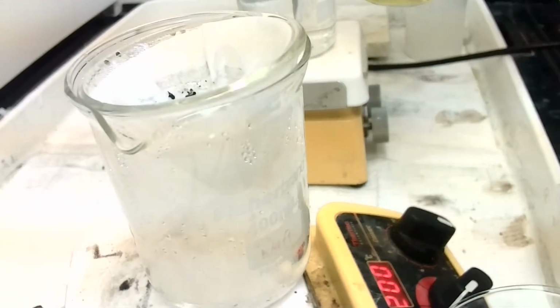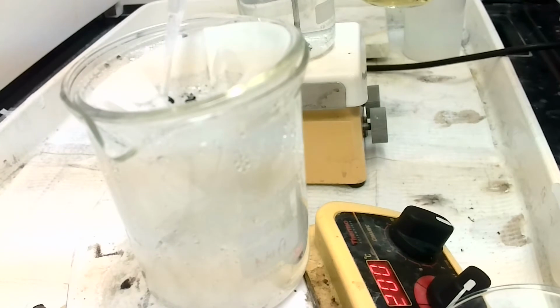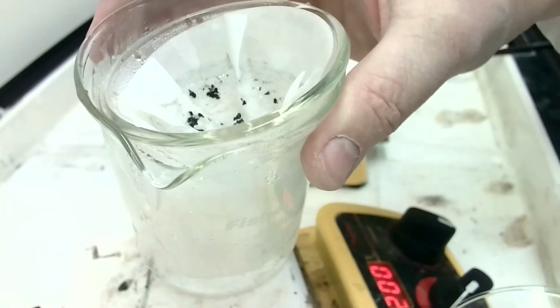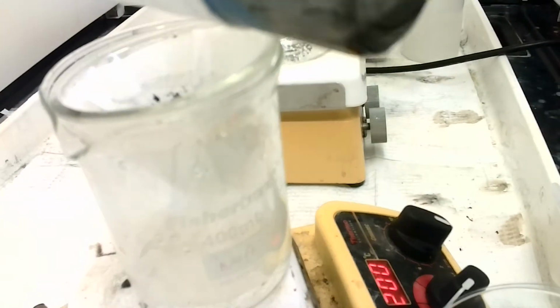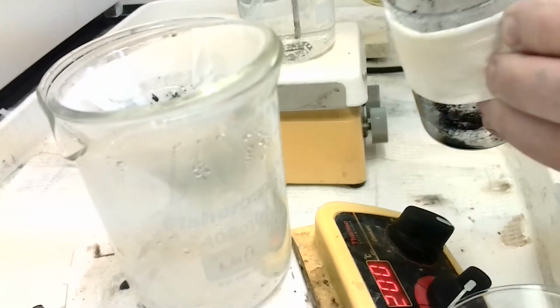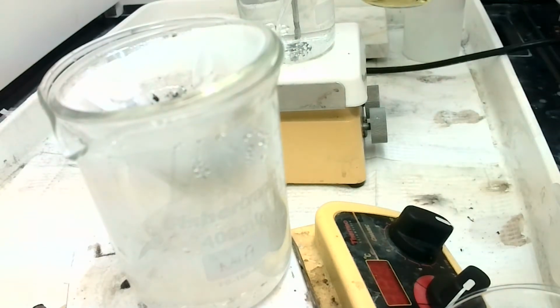A little bit. Yeah, if you catch the light just right, you'll see the sparkles are forming right along in here, right along the edges. You'll see some right there. Okay, anything that sparkles is our product. We want it to go through the filter paper. So I'm doing another rinse from the beaker with boiling hot water. I'm going to rinse this a couple times to ensure complete transfer.